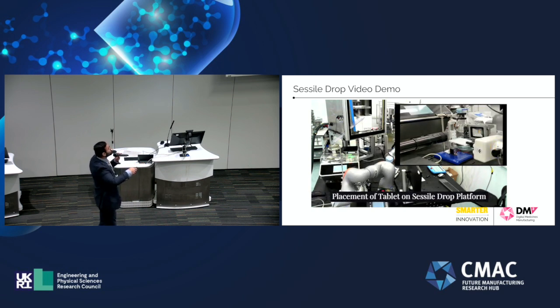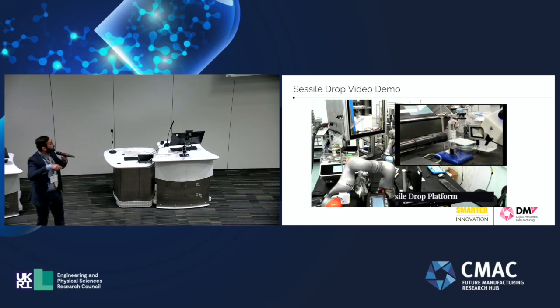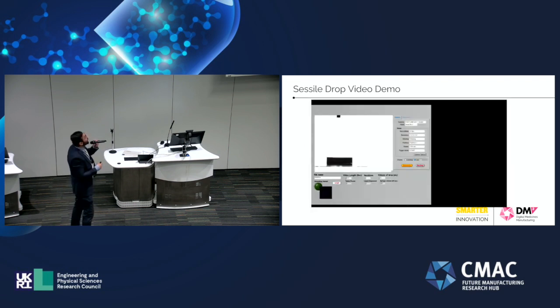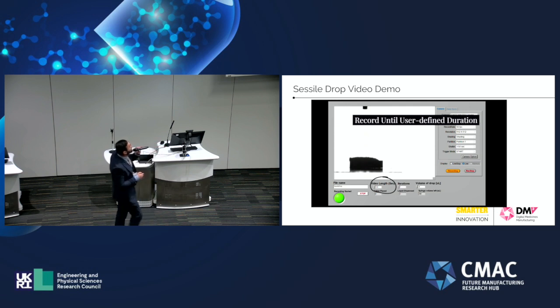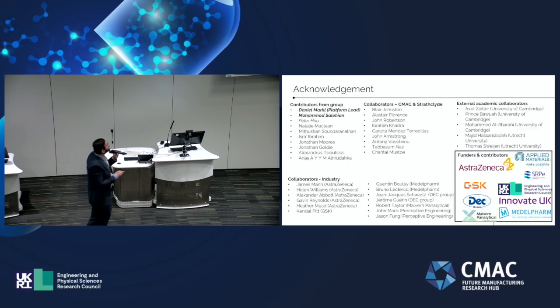And obviously, based on a predefined value for the duration of the video that we want to record for the investigation of swelling kinetics, initially we dispense the liquid on the tablet, and in this case the video length was defined as around 120 seconds, and you can see how the tablet is swelling upon coming in contact with the liquid.